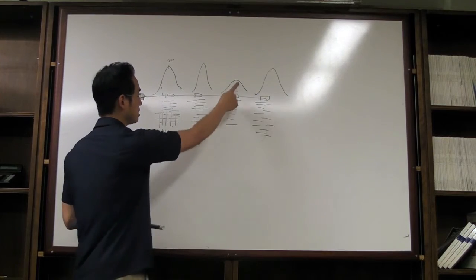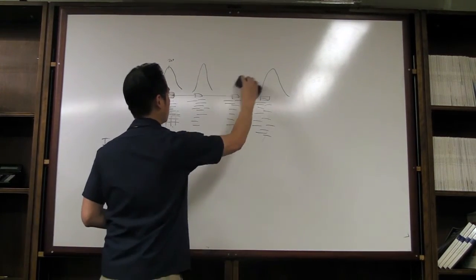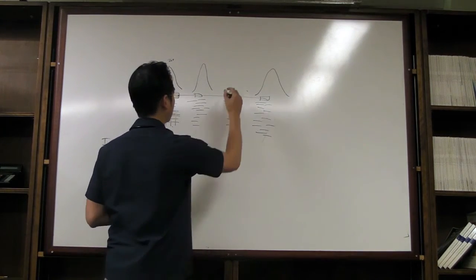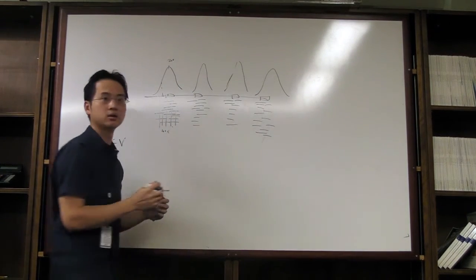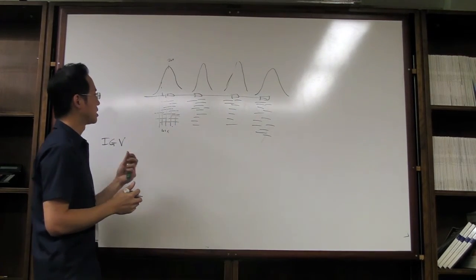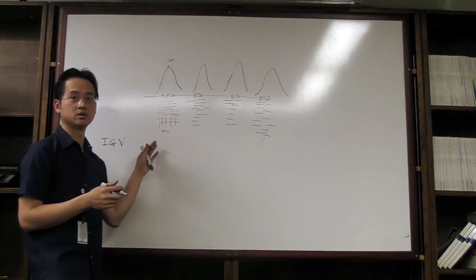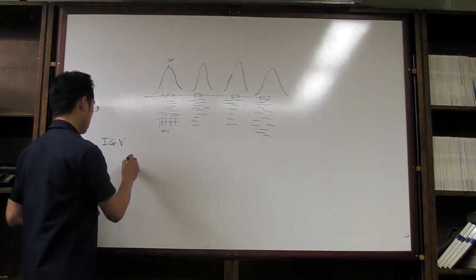So perhaps you see this on the first one, you say, okay, let's boost up the baits for this in SureSelect, so that I can get a little bit better coverage. So that's sort of a trial and error kind of thing that you have to do. And so you have sufficient coverage now. And the question is, you know where it's mapping genomic-wise, but you really have no idea what this is, right? So the next step is to do annotation.